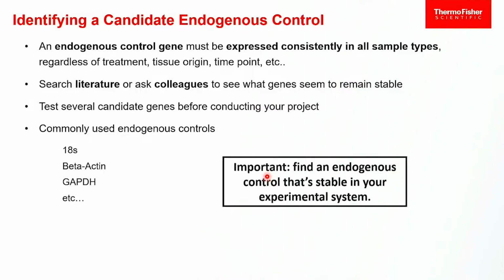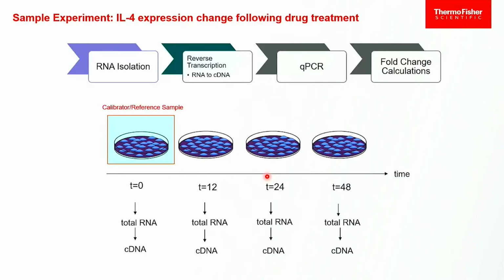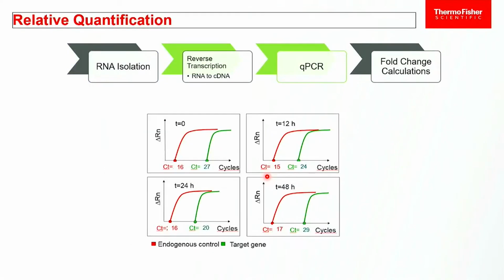All right. So I had a time course. Again, I mentioned I've got RNA I'm collecting. I am going to go ahead in my amplification reaction and do RT-qPCR. This is my result. The green is my gene of interest, my target gene, the one I'm interested in looking at.